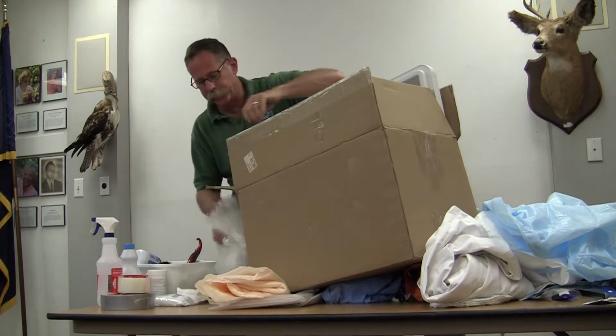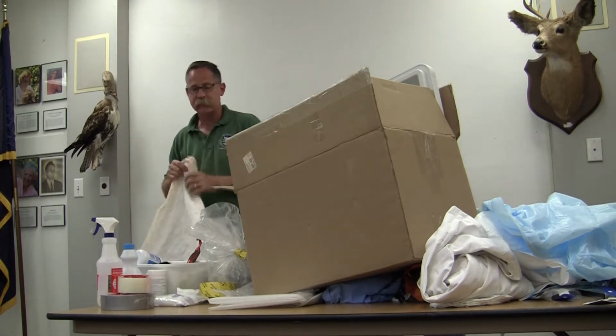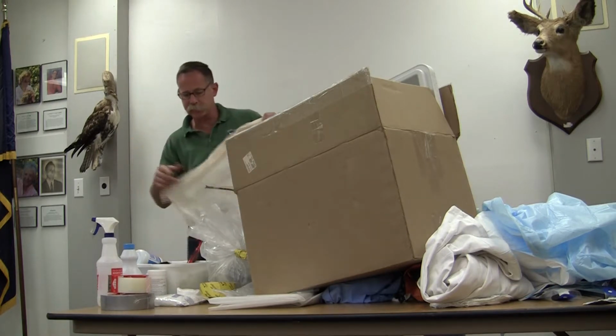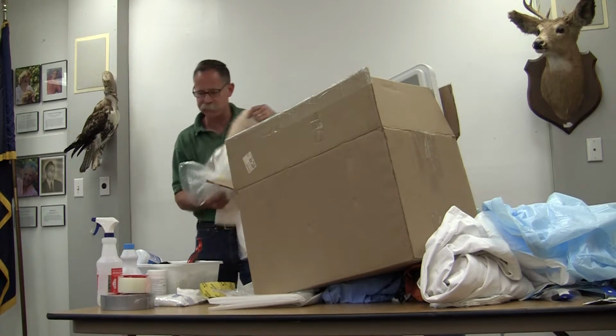So the first thing you want to do is take one of these absorbent pads that we use for CWD heads. You can use these for anything. If this was a real messy carcass, you could have put it between the bags and bagged over it to collect any juice that may come out.